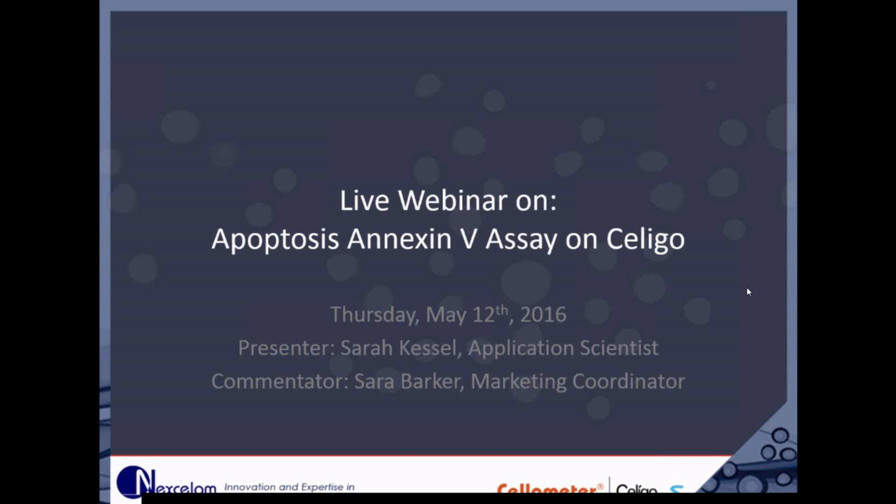All right. We have an unrelated question. Can this instrument be used to image larger cells in colonies or spheroids? I guess the question is, is the overlay analysis going to work correctly? Are you looking to identify a single cell inside of a sphere?